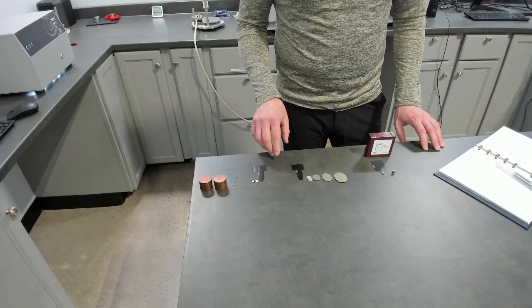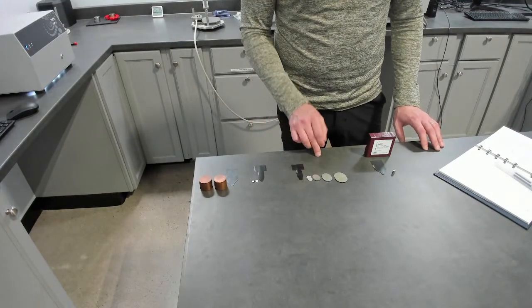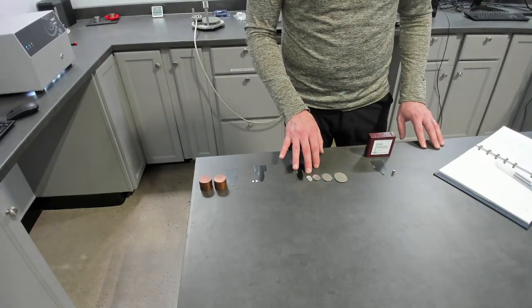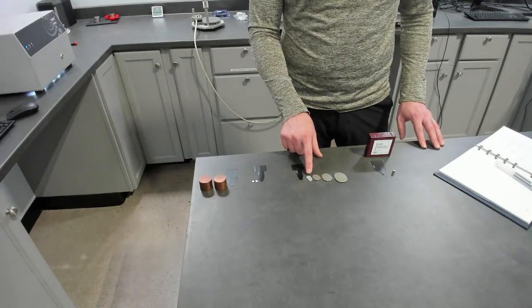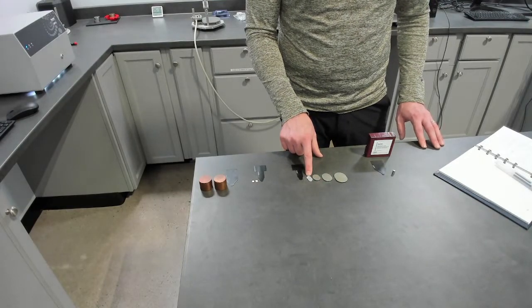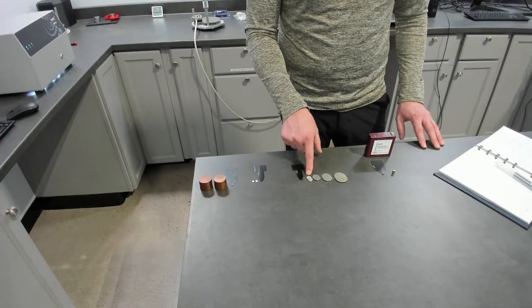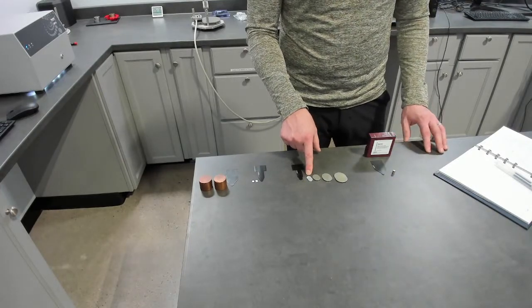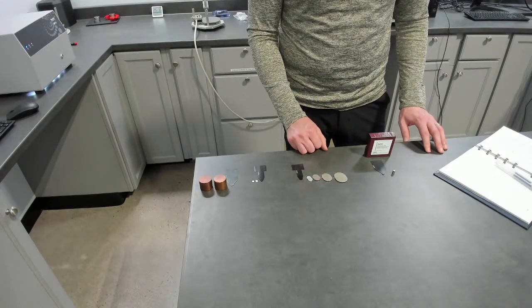In fact, the ranges are 0.25 seconds, 0.5 seconds, 1 second, 2 seconds, etc. But on the shortest time, while we're collecting 600 points, you can see the advantage, because we can measure such a material with a high diffusivity. That's a very difficult measurement if you're not collecting a high number of points like we are. And you'll see that example when I share the software and the data we've measured.